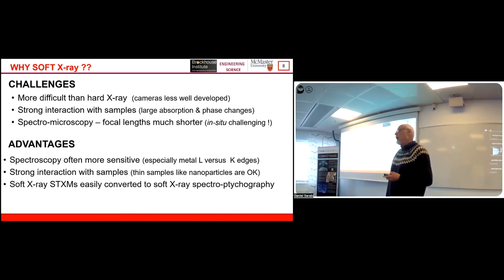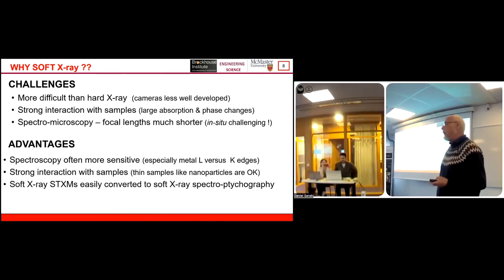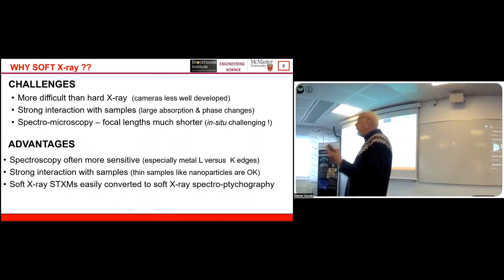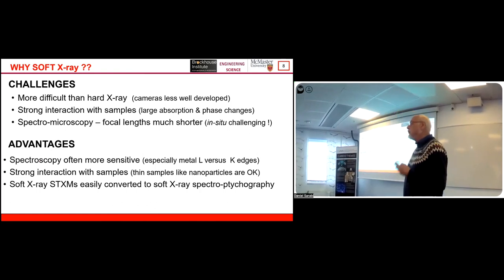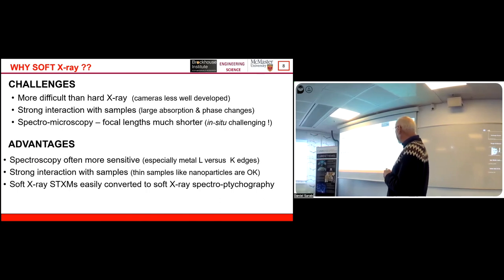So you might ask, because a lot of the people of this community are coming from a hard X-ray perspective, right? So we got to basically phase sensitivity. We can look at things that you don't have strong interactions with your sample, but using the ptychographic technique can really improve the resolution over some other spatial resolution methods of studying samples.